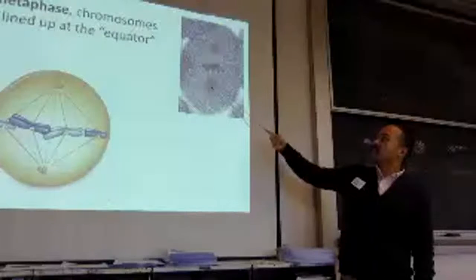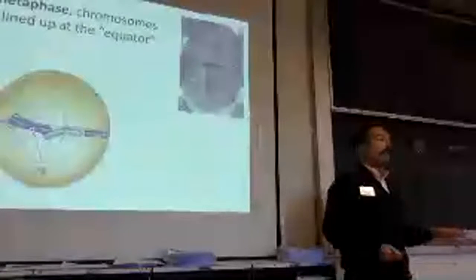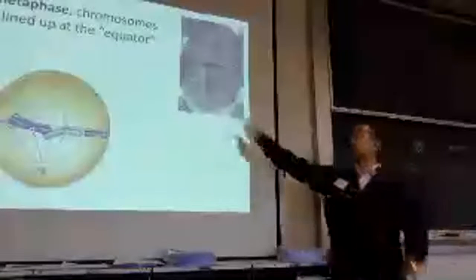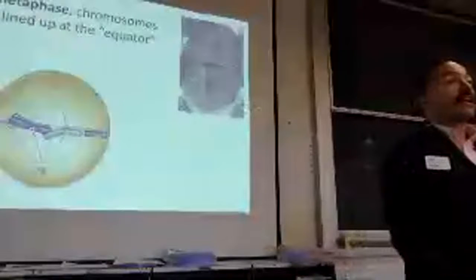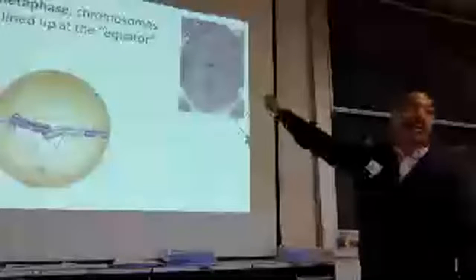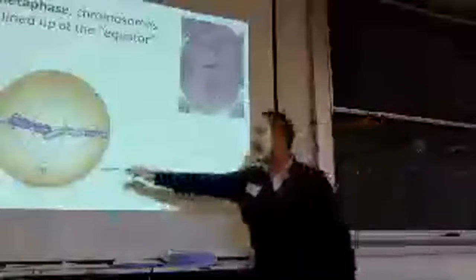Structures, you see these spindles. So that's a very, hopefully, simple thing to recognize. If you see chromosomes lining up, you must be in metaphase. Are the centrioles actually connected to the chromosomes? Yes, they are. They're extending a special protein molecule and attaching on either side.